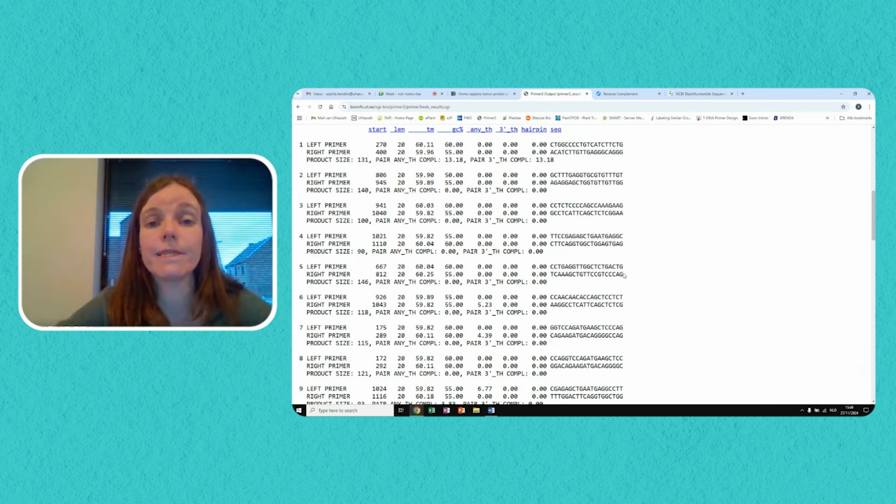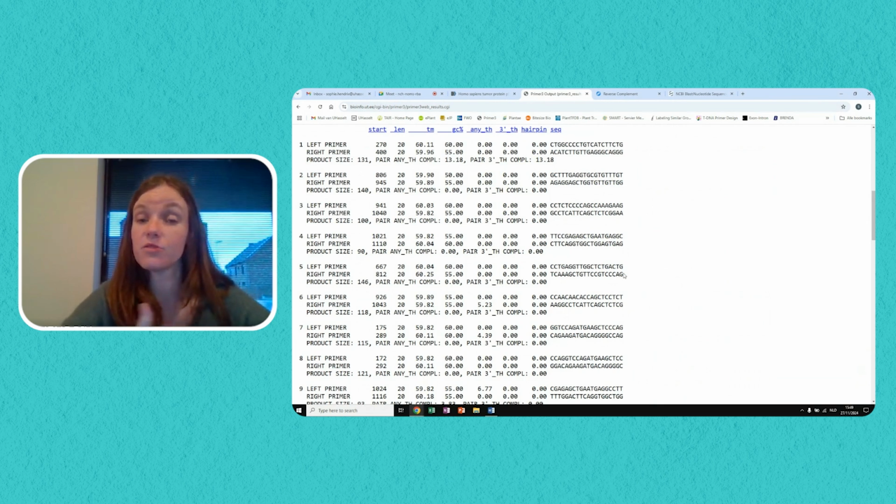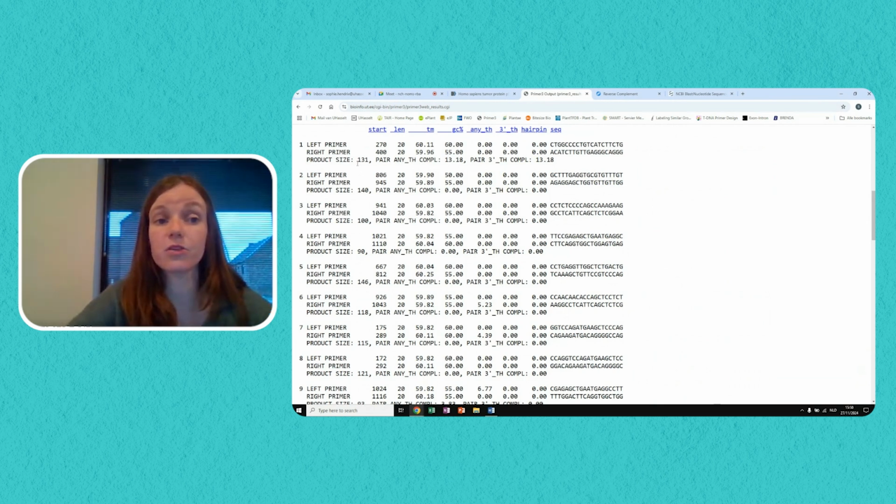After watching this demonstration, I hope that you will now be able to use this knowledge to try and develop primers yourself for genes of interest that you want to measure using qPCR.